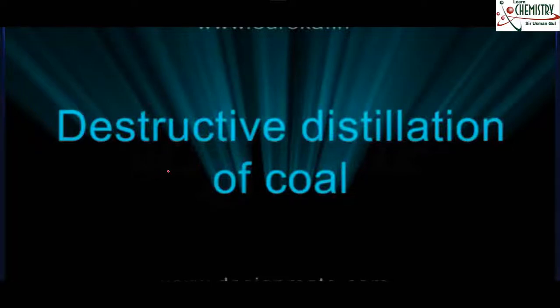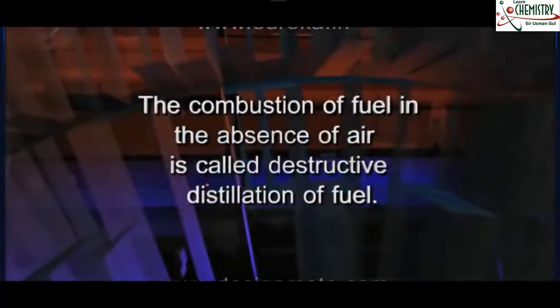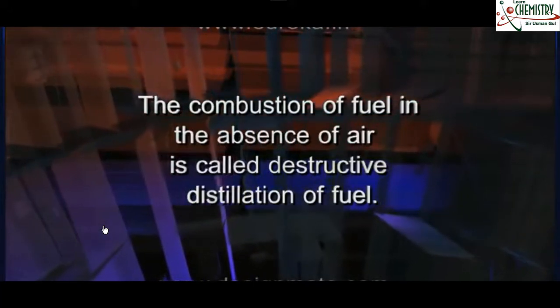In this lesson I am going to explain what destructive distillation of coal is. For that I will show you the video of the destructive distillation of the coal. Okay, number one thing, what is the definition? The combustion of fuel in the absence of air is called destructive distillation of the fuel.